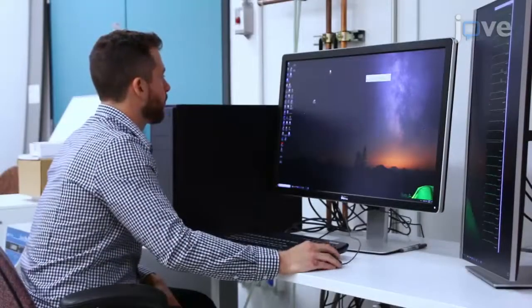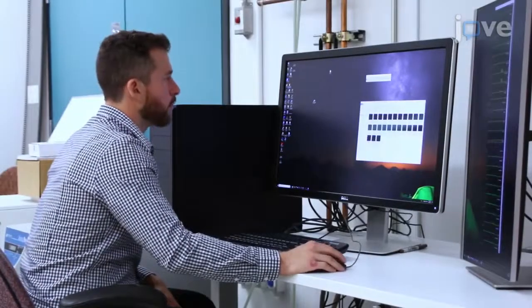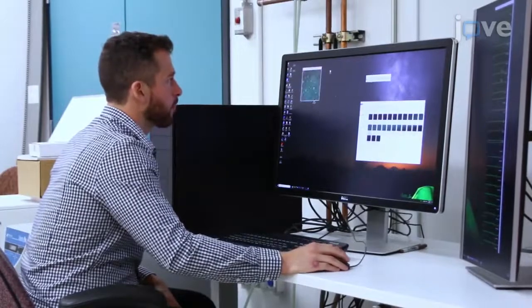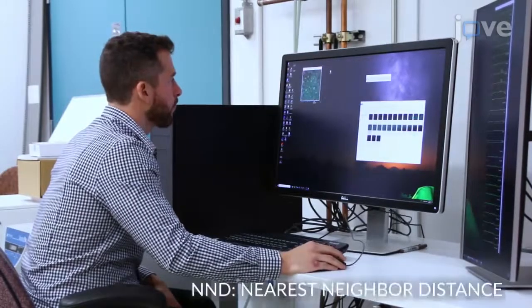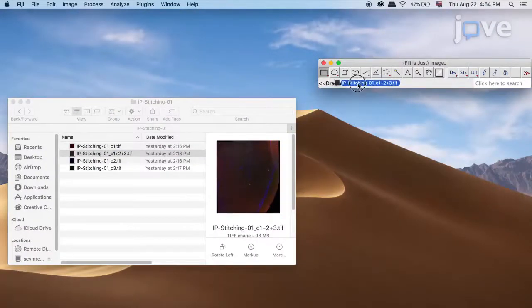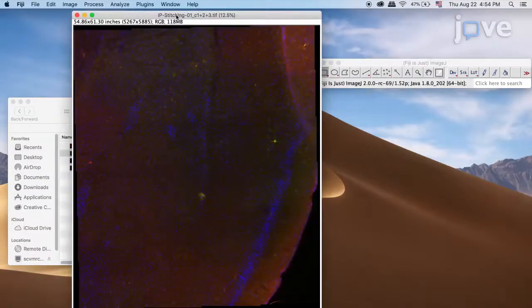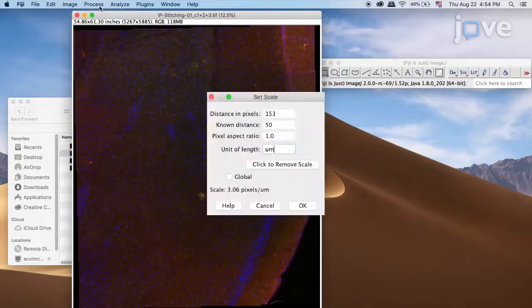To begin this procedure, open an image processing program, such as Fiji or ImageJ, that has the nearest neighbor distance plugin installed. Open the 20x image. If the scale is contained in the metadata of the file and not automatically set from the metadata, on the menu bar select Analyze, Set Scale, then enter the correct information.